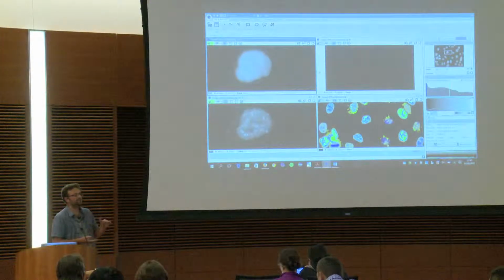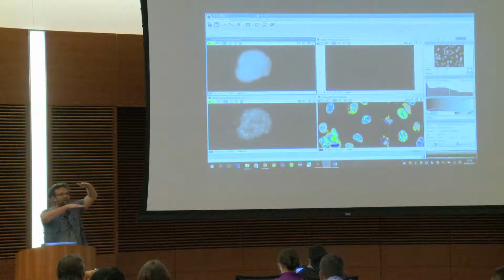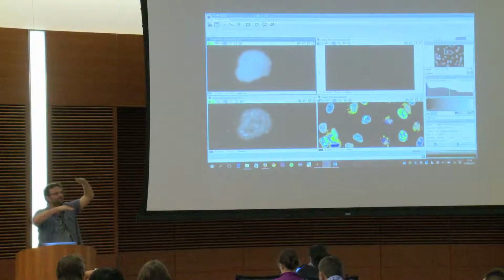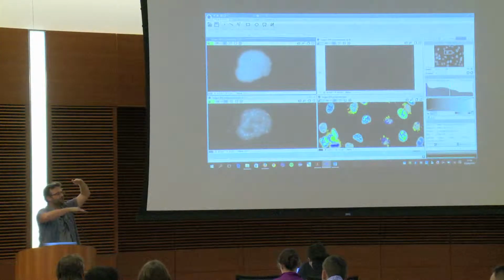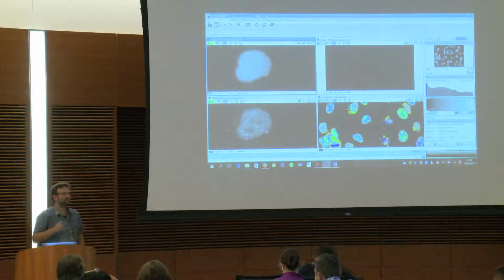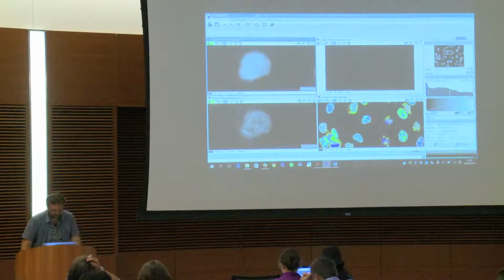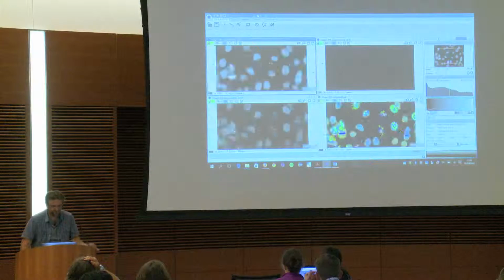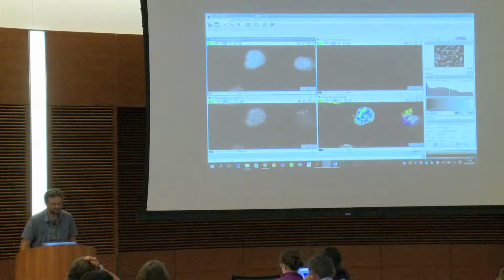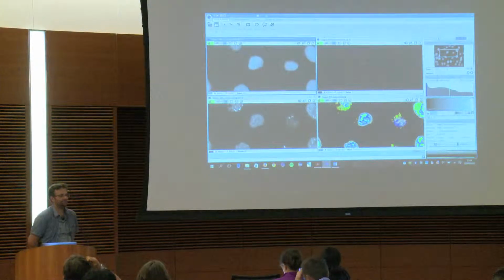It's because if you have a 3D and time stack, you can synchronize, let's say, only time, so that you can see in a viewer a specific Z, and in another viewer another Z, but you keep synchronizing the T. And the same for synchronizing 2 time points, but not Z. And if you want to affect the channel directly, you can just press 1, 2, 3, 4, or Shift 1 if you want to affect it to all the different viewers of the app. Okay?